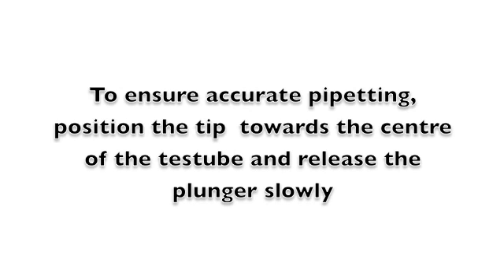To ensure accurate pipetting, position the tip towards the center of the test tube and release the plunger slowly.